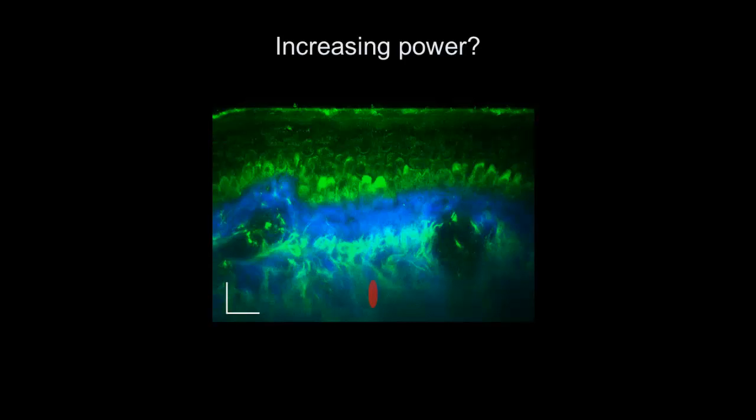Focal volume is more extended due to scattering. It's also less bright, okay? That's because I've lost a lot of photons. The non-ballistic photons don't arrive here, and so the overall intensity of the excitation light is much less. So there's enlargement, and there's loss of excitation light here, and this is at the level of excitation, and the light even has to come out still.